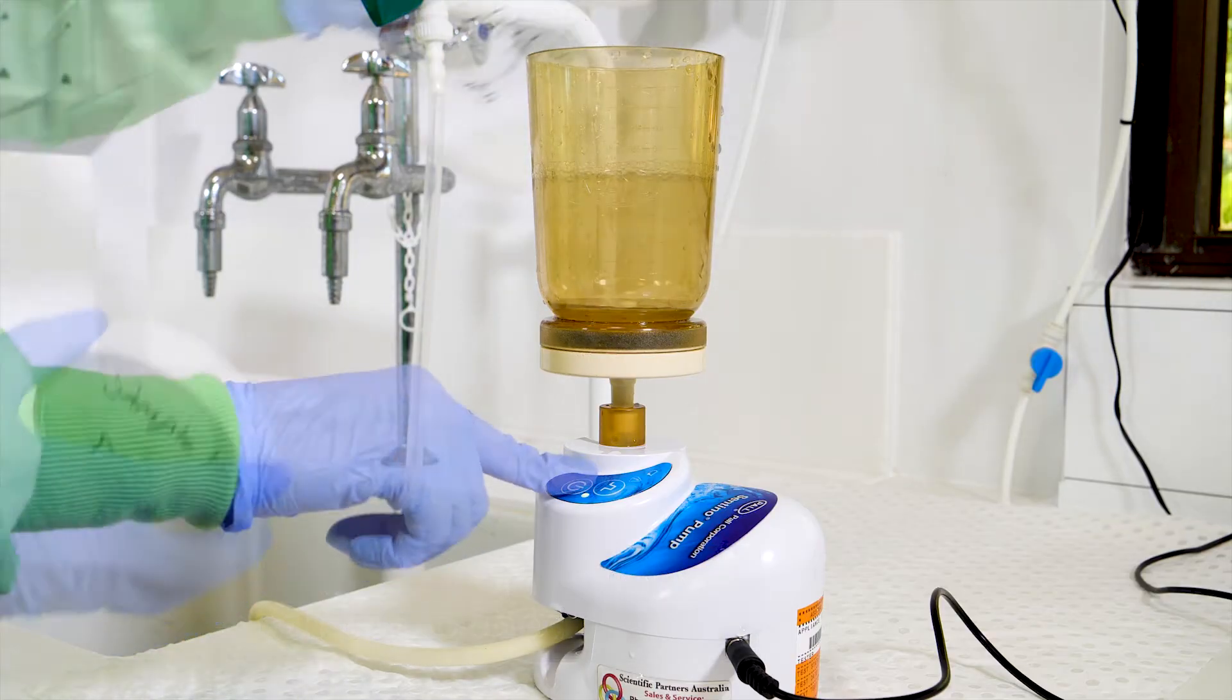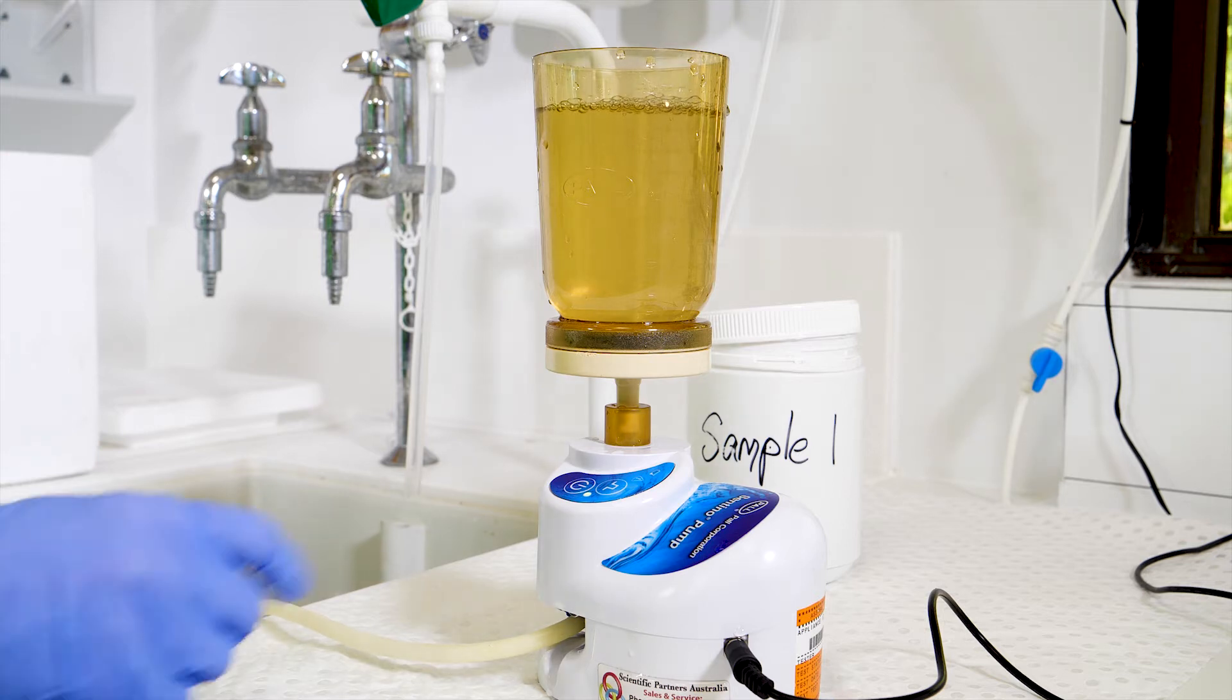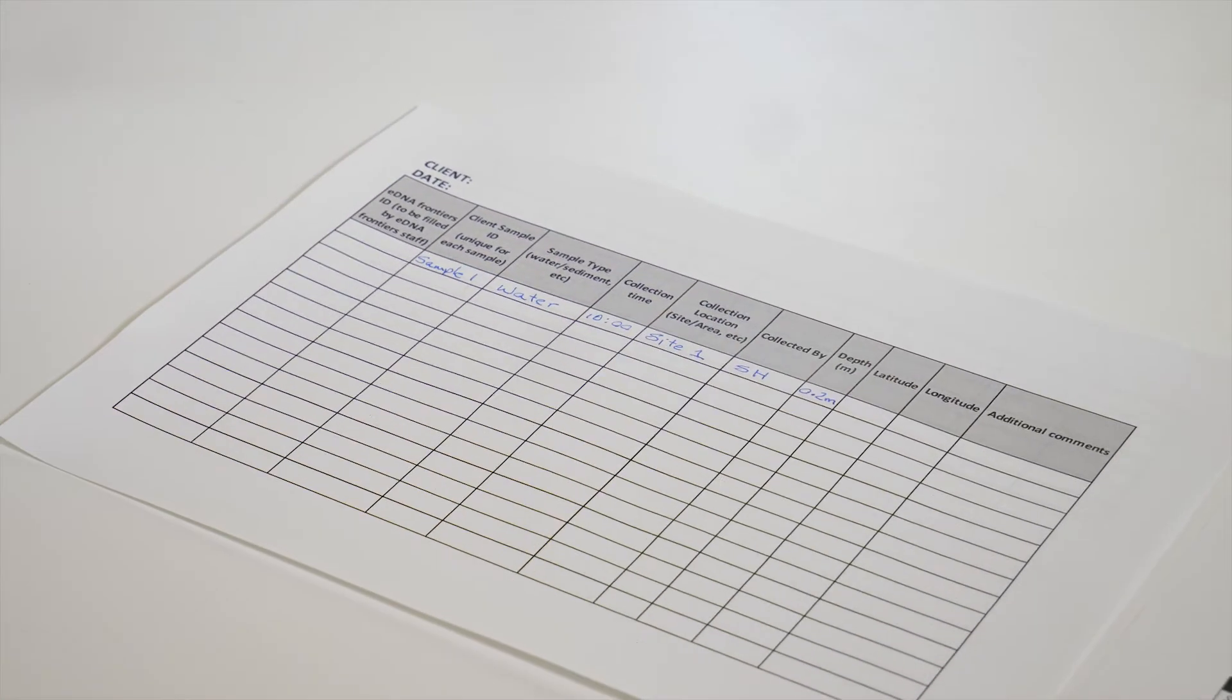When the water volume completes filtration, stop the pump. If the water is very turbid and the filtration of a single sample takes longer than 30 minutes, the membrane may be clogged. Stop the pump and record the volume of water filtered on the sample sheet. You may discard the remaining water sample.